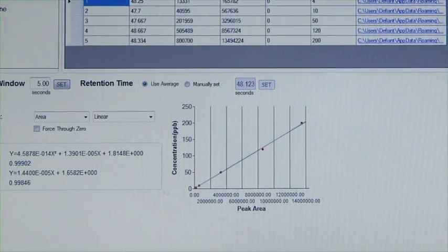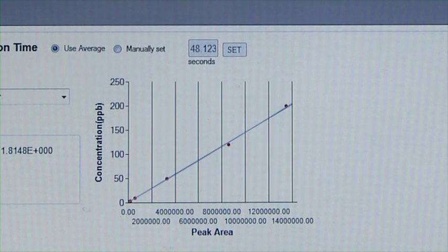At least five different concentrations should be used to calibrate the instrument. Elvin will produce a relationship between analyte concentration and the peak height or peak area. This relationship is called the calibration curve.